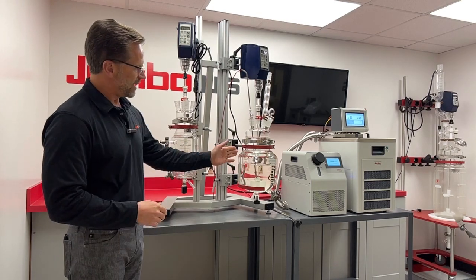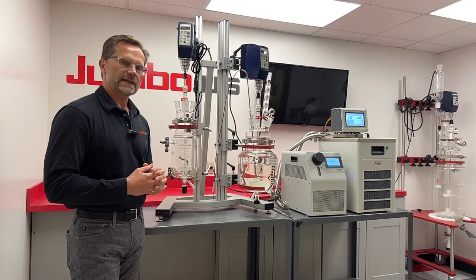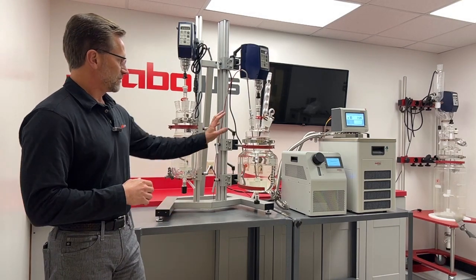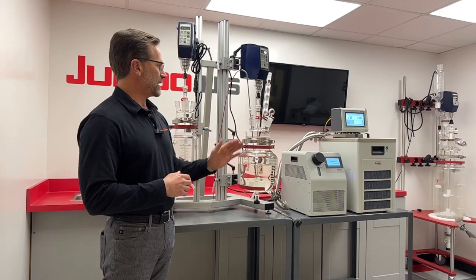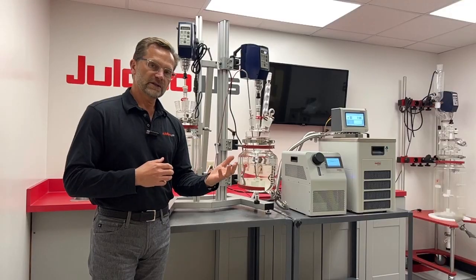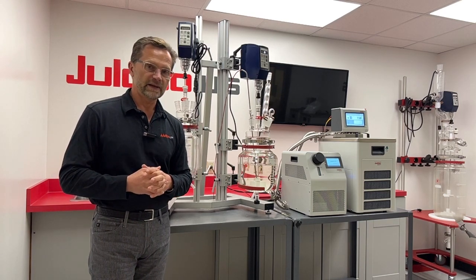Here we have a 2 liter and a 4 liter going, and you have the full array of Ace variability with reactor type, drain ports, reactor lids with ports, and accessories that can go on top for any type of process — synthesis, purification, or distillation — that you might require in your research activities.